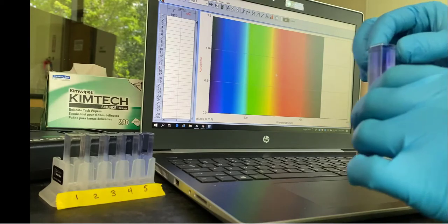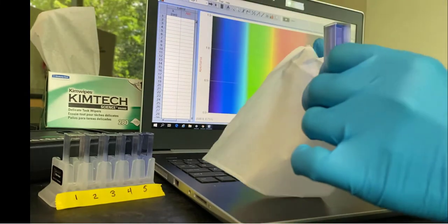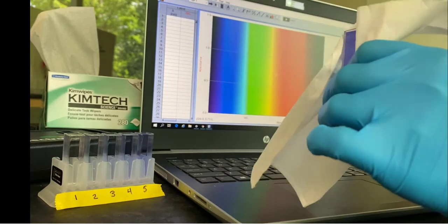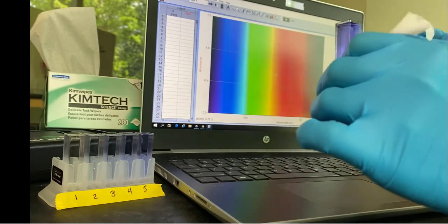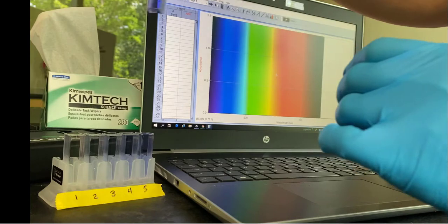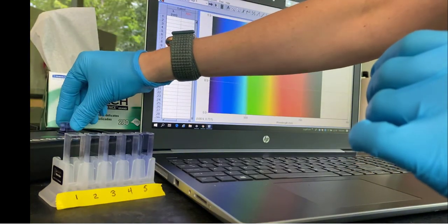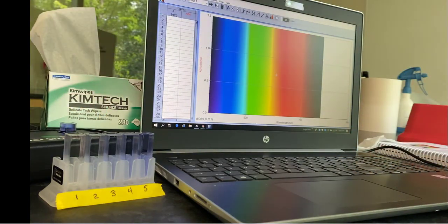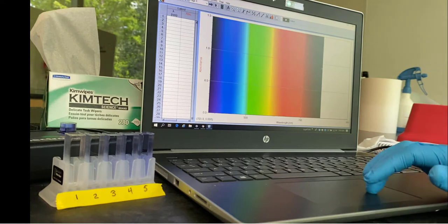In this video you can see the computer that's hooked up to the spectrophotometer. Here I am wiping the cuvette, cuvette number nine with the most concentrated dye, and placing it into the sample holder of the spectrophotometer.